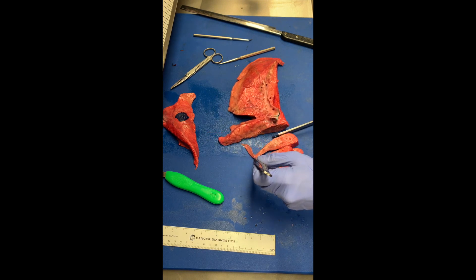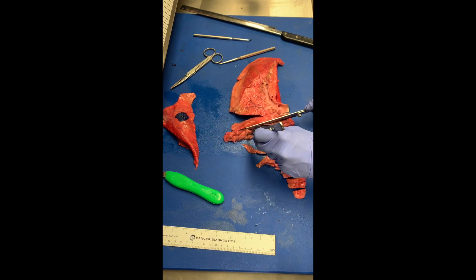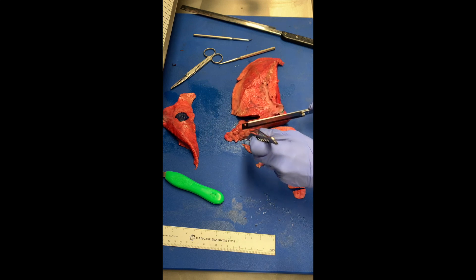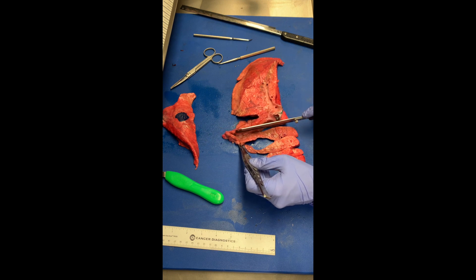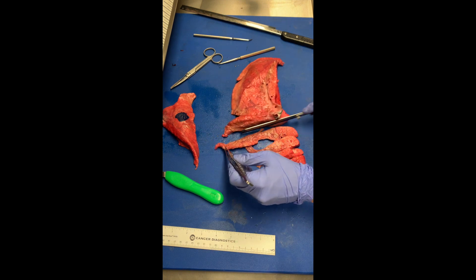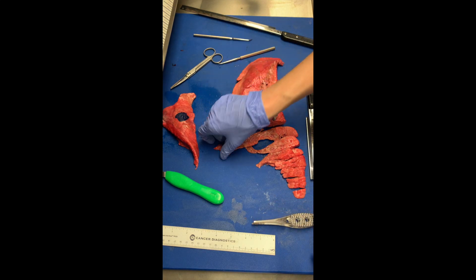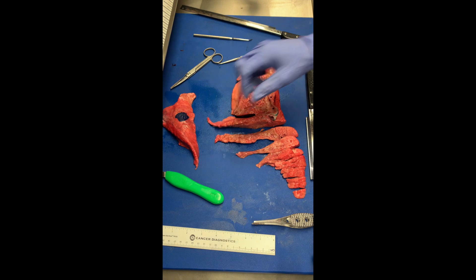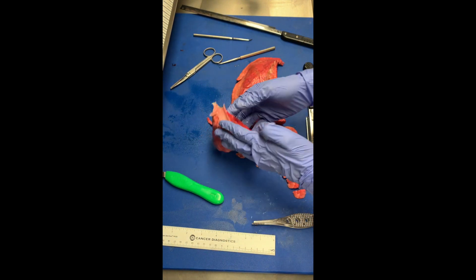The nice thing about lung is that while orienting the specimen and maintaining your slices is important, there are no specific anatomic structures here that I need to be specifically worried about. So continue serial sectioning all the way through, and you would also serially section this half as well.